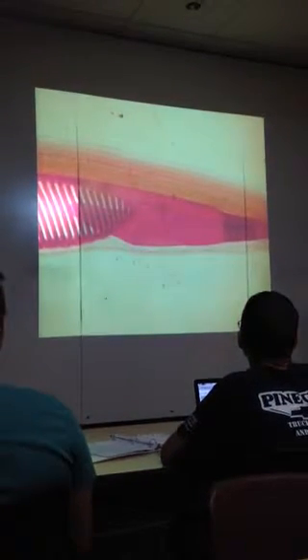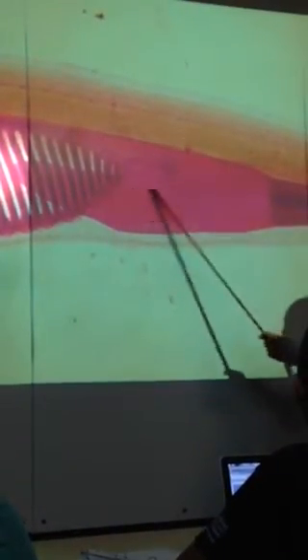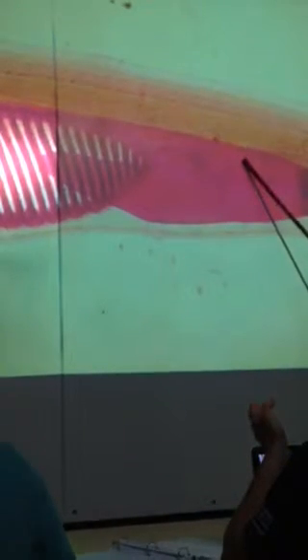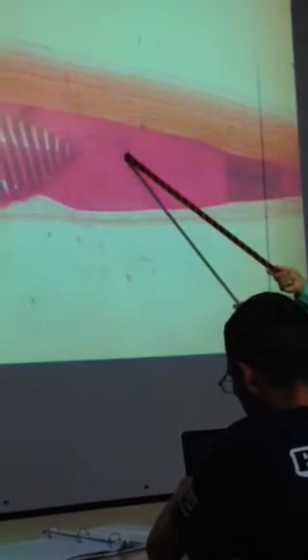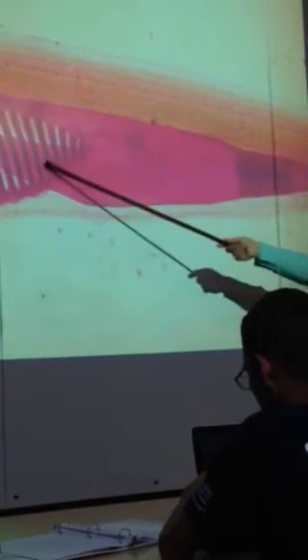All right, we're further back, right? So what's this part called coming down through here? What's this in this region? It's the esophagus up here, right? But what's it called when it comes back here? Here's the ileocolic ring right here, right? They call this the stomach. They have esophagus, hepatic cecum. That's this right here.